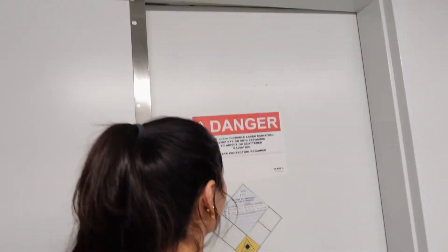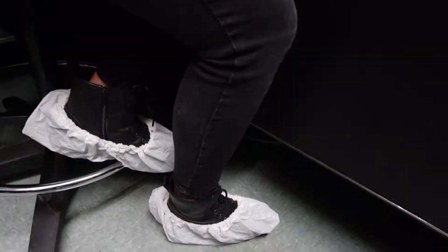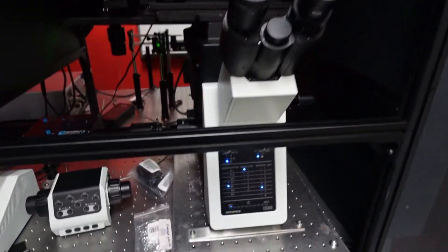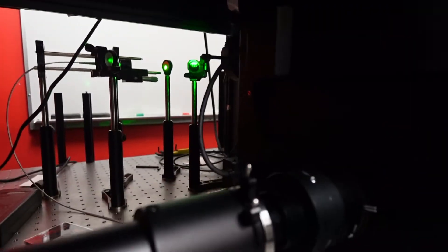When we have visitors come to our lab, we show them everything. But I think one of the big things we like to show them is our single molecule fluorescence microscope. And so this is in a really fancy lab that has climate control and dust control. It looks like a microscope. But it has all this cool optics and laser stuff going into it.